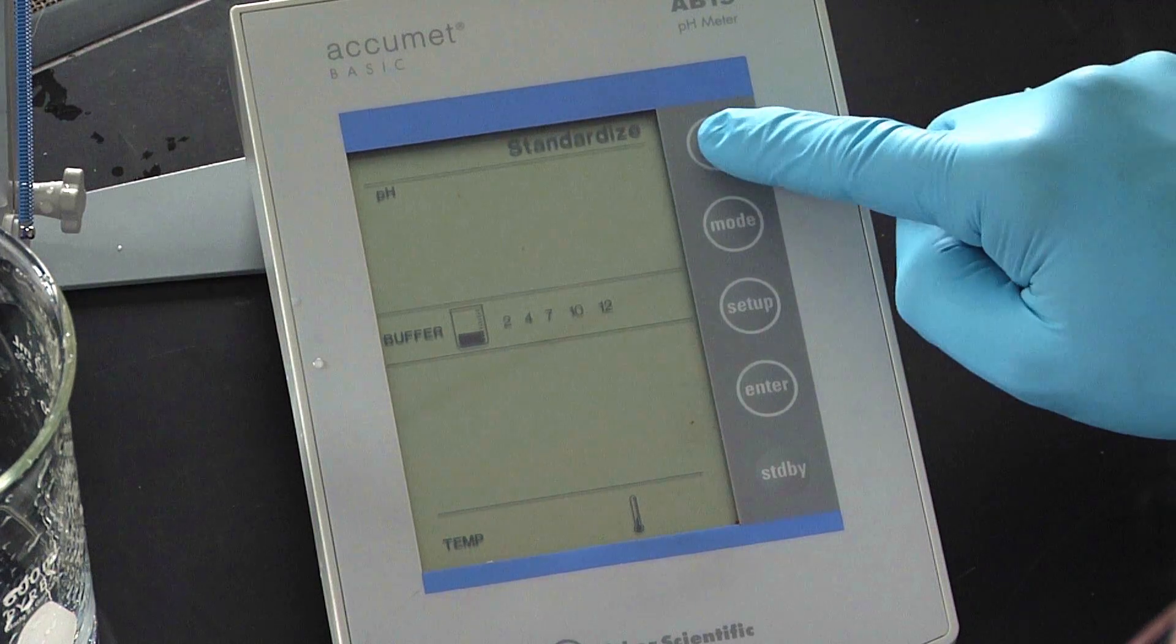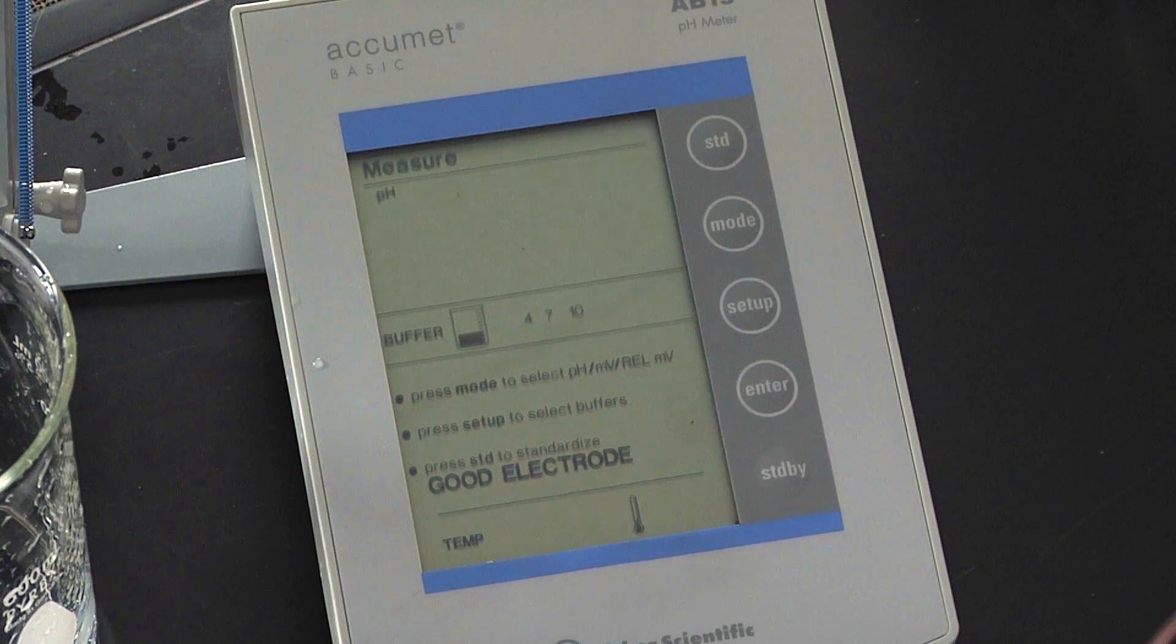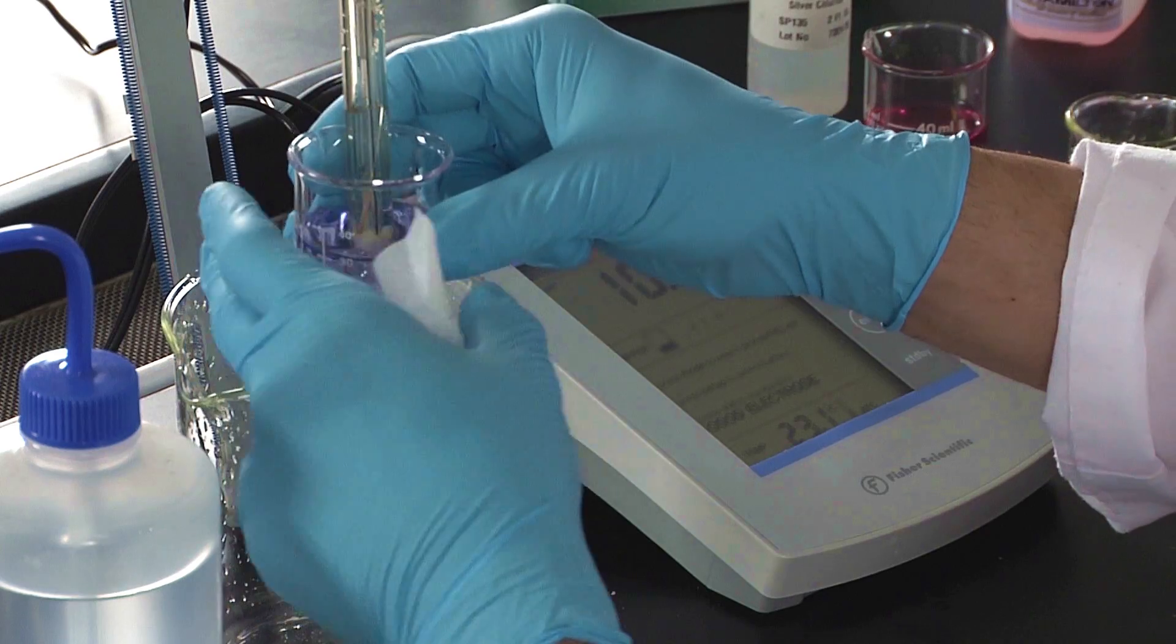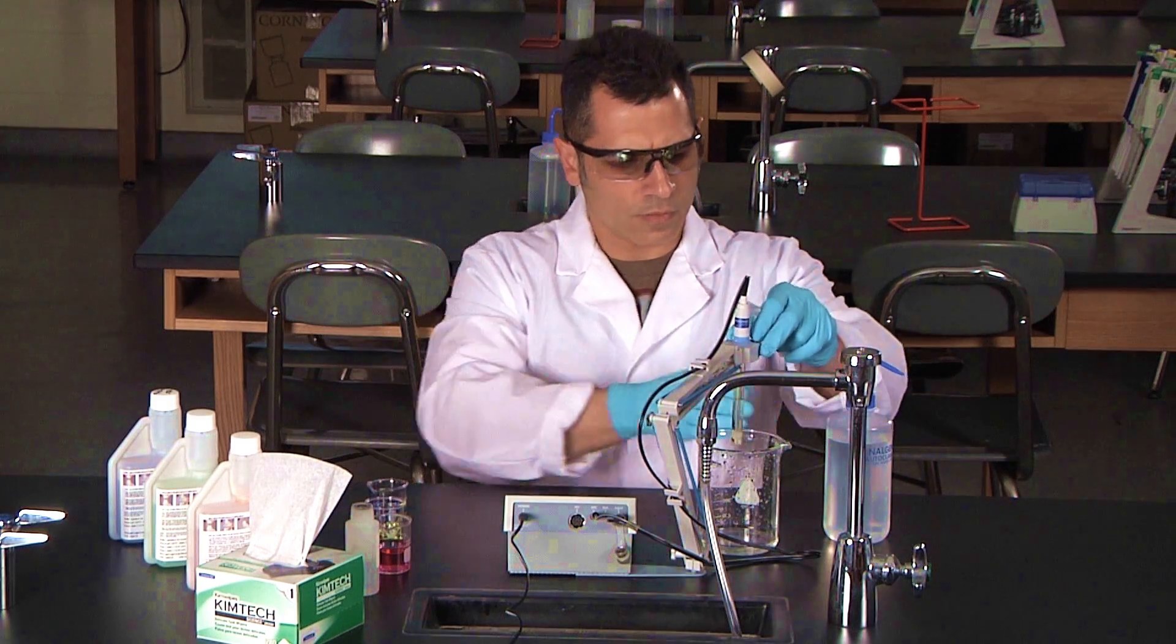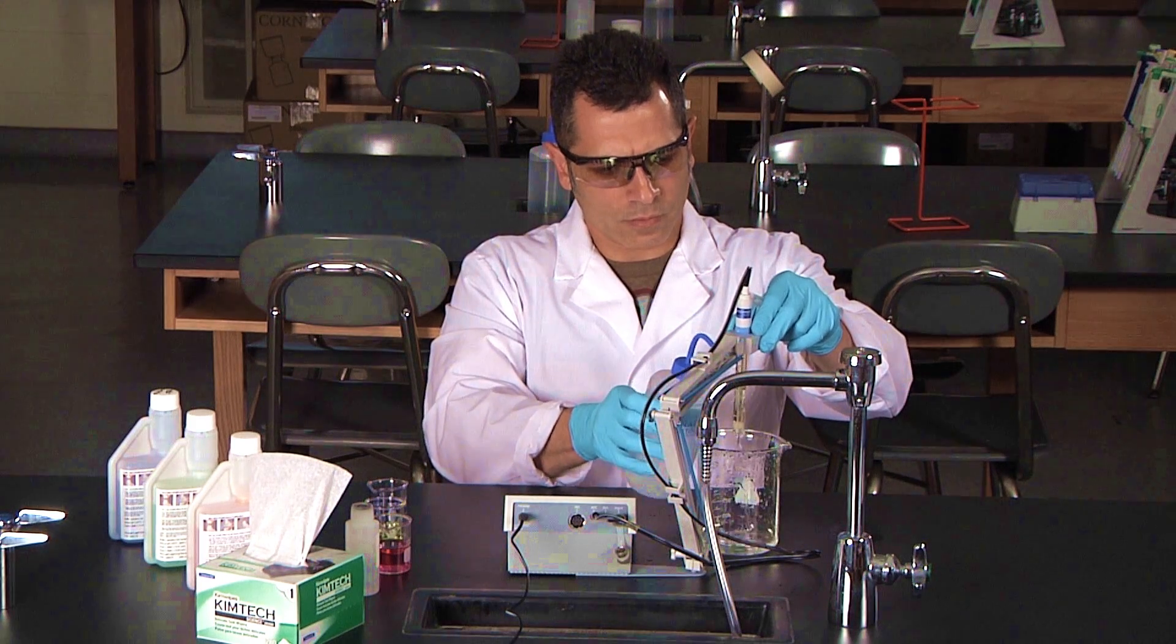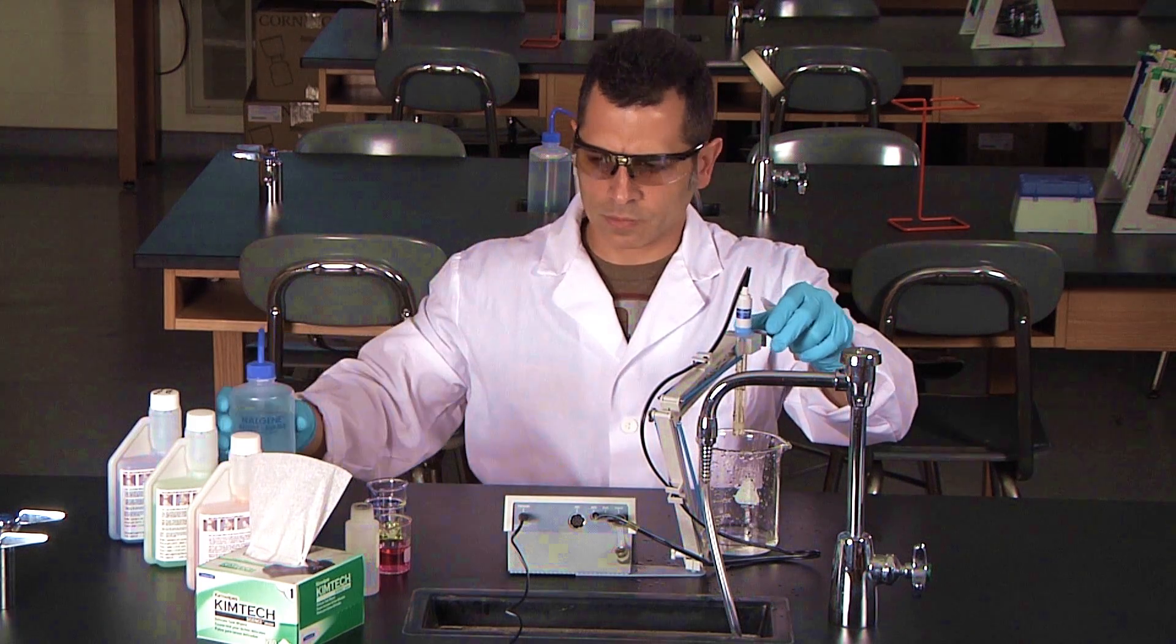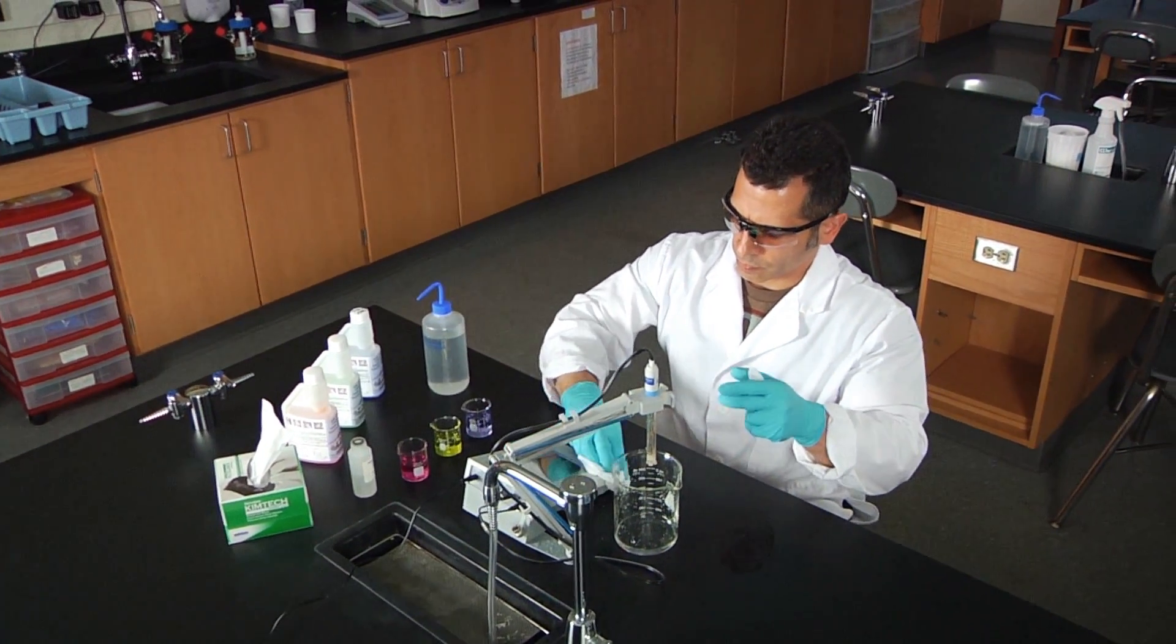Press the standardized key. Remove the probe and rinse it with the deionized water. Dry the glass bulb and place it back into the storage solution.